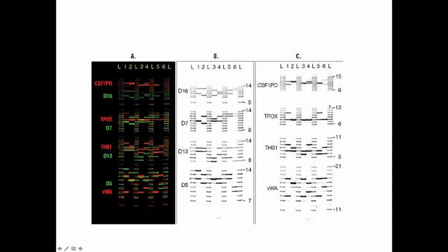So most people vary between 6 and 13 repeats at the TPOX locus, which you'd say, well, how am I going to be able to distinguish between 6 and 13 and 6 and 15? The answer is, where are all of these primers found relative to these number of repeats? At the VWA locus, the primers are very, very close to the repeats, so all the sizes are generally smaller. In the CSF1PO locus, the primers are farther away from the individual numbers of repeats, so the sizes are generally much larger. So they're all separated in a gel, but they're all in their own individual little size ranges.